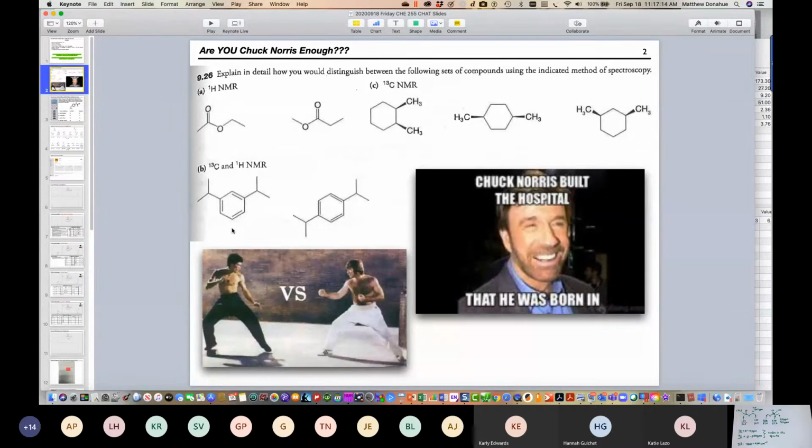So I see some answers that say symmetry, and yes, there is definitely symmetry in the molecule. We had a lot of initial responses of 6, but then we have some that are different. So let me draw out that compound. So there it is. In this class, I'm not really about math or any really hardcore mathematical concepts.